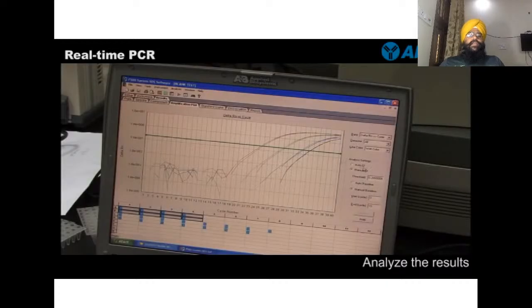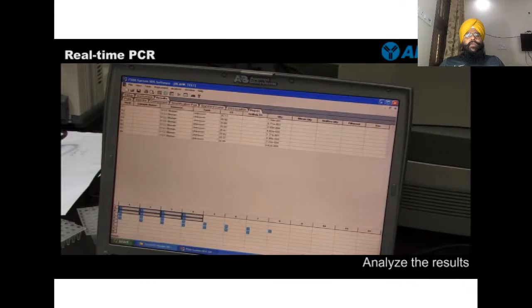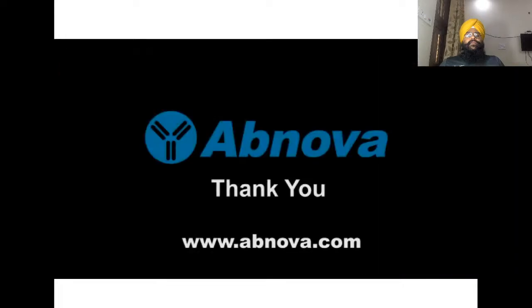Let me analyze the results. You can see some peaks are coming up. So these things you will do when you're using this software. It will automatically give you the values of your samples. You do them in duplicates or triplicates. Yeah, that's it.